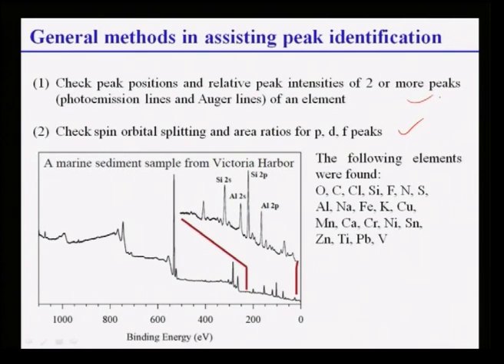So let us see the following things. Here the plot is showing aluminum and silicon. You see this is coming for aluminum 2s, so we can know the peak position for 2s, and so the binding energy can be calculated. Aluminum 2p also, silicon 2s, silicon 2p, but it does not tell about the spin orbital splitting.